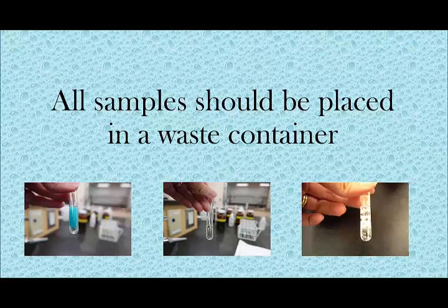After the lab, all of your test tube contents should go in a waste container.